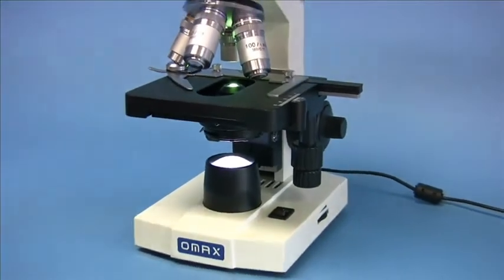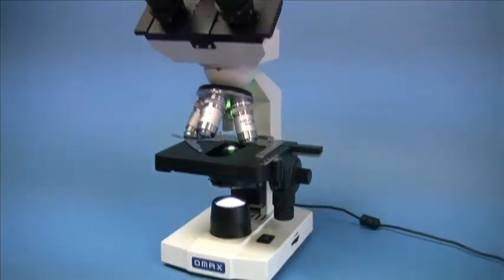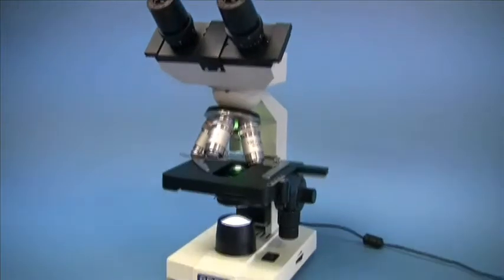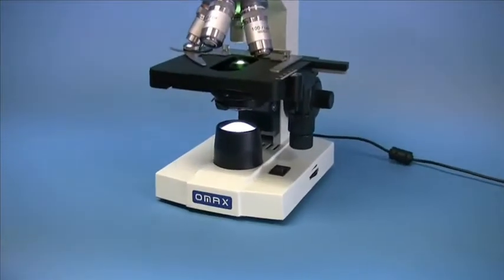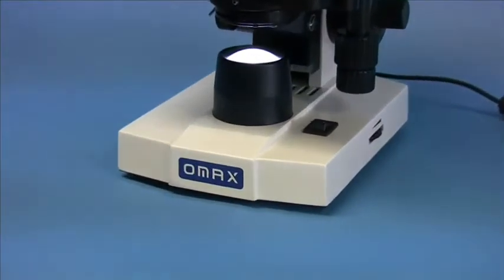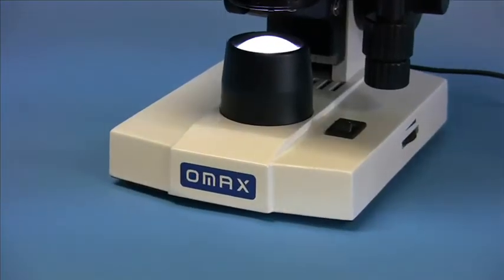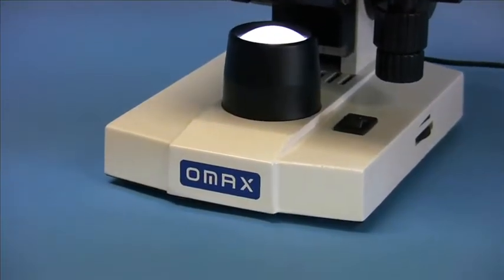As you can see, this M82ES model of OMAX is compact, inexpensive, and has fully loaded features. It is perfect for anyone who wants to do some scientific experimentation or lab works.